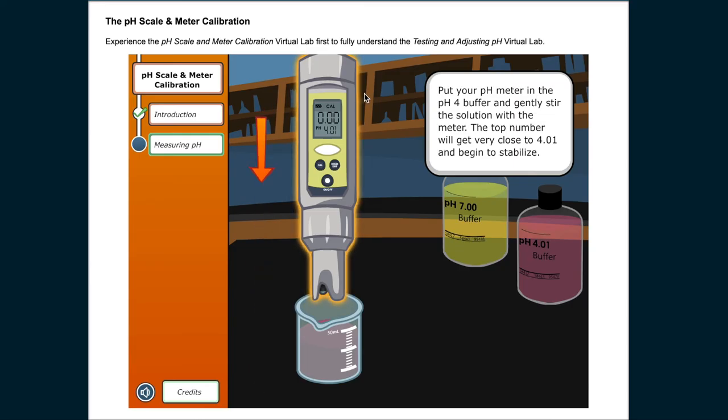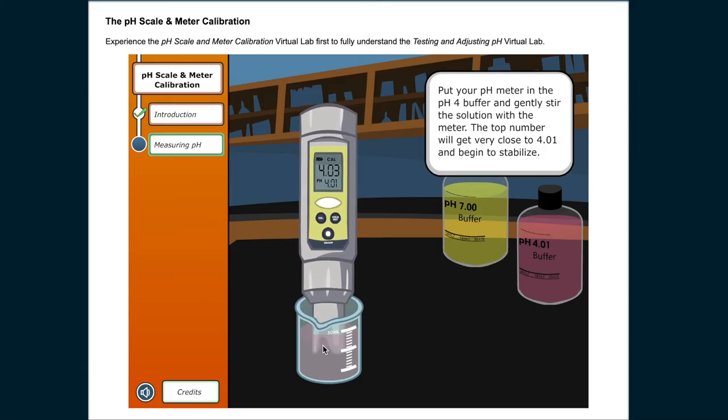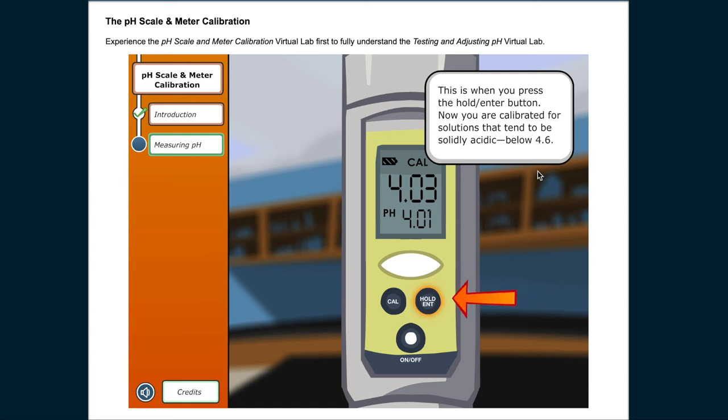Put your pH meter in the pH 4 buffer and gently stir the solution with the meter. The top number will get very close to 4.01 and begin to stabilize. This is when you press the hold enter button. Now you are calibrated for solutions that tend to be solidly acidic, below 4.6.